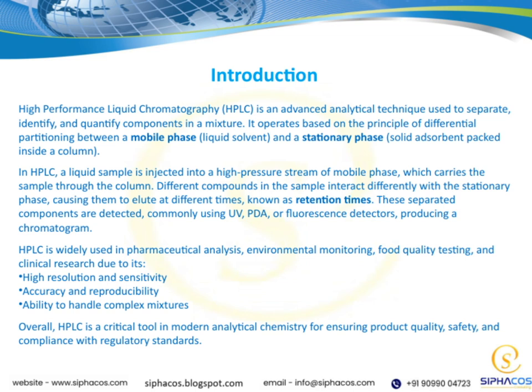In practice, we inject a liquid sample into a high-pressure stream of mobile phase. This stream carries the sample through the column, where the magic happens. Because each compound interacts differently with the stationary phase, they don't all travel at the same speed. This causes them to elute, or come out of the column, at different times. These are called retention times.